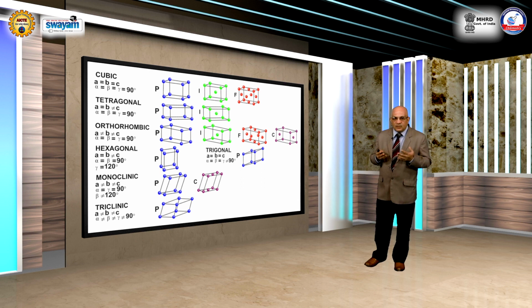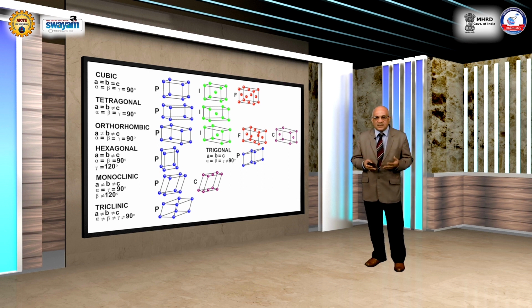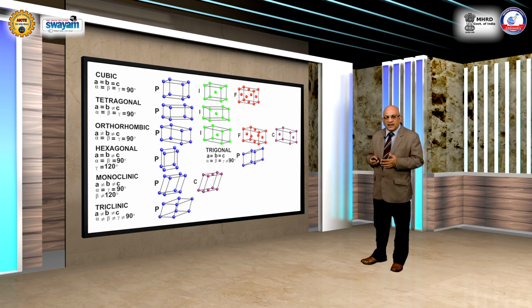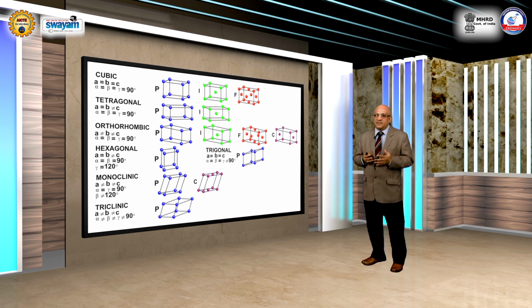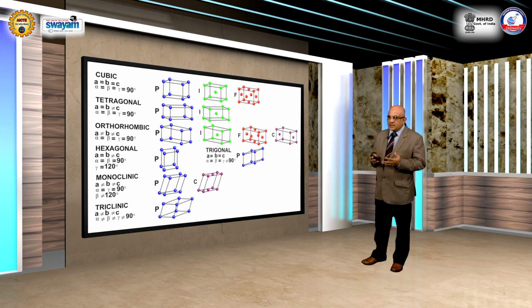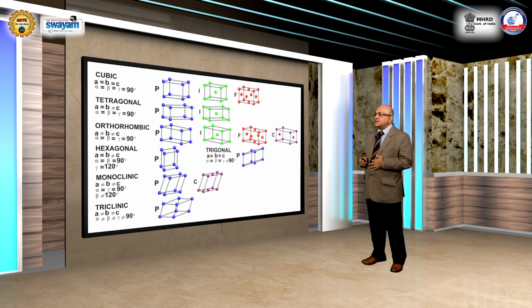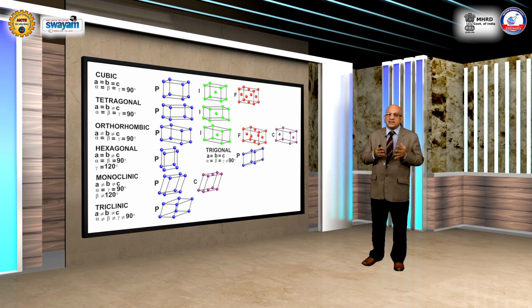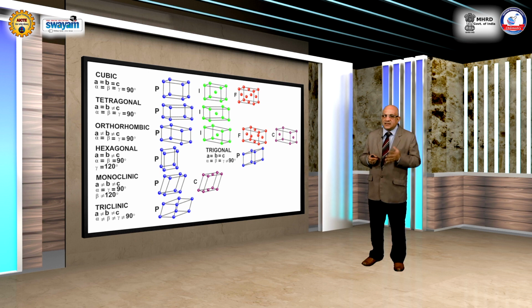However, if you look at the bottom, you have a tetragonal cell where a = b ≠ c and angles are all 90 degrees. So, you need now two parameters. So, you can get these parameters, which are called the lattice parameters, from X-ray diffraction, and you can also index each of these reflections based on HKL planes.